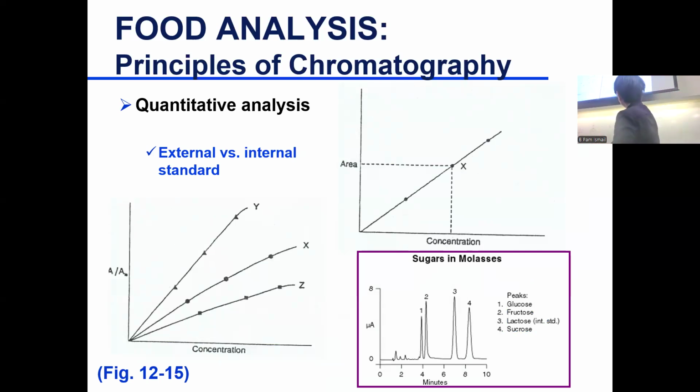So you prepare 4 or 5 different concentrations like you did in the caffeine lab. And then you measure the area under the curve, or the computer generates the area under the curve, and you plot, you get the equation of the line, and then you calculate concentration in the unknown based on its absorption. Very easy.